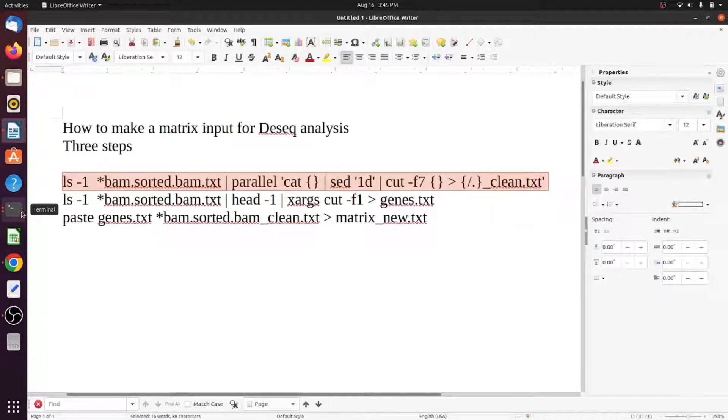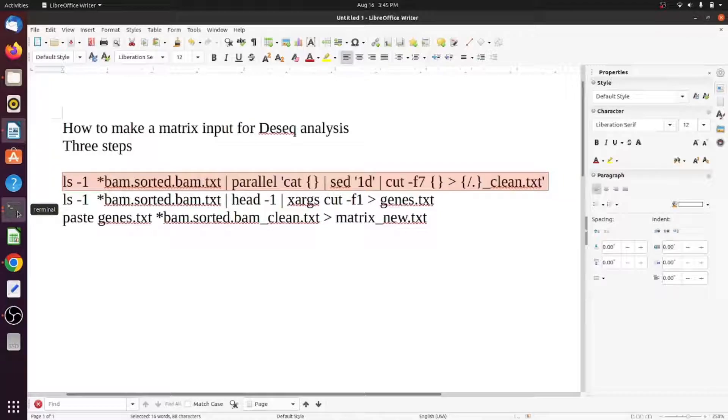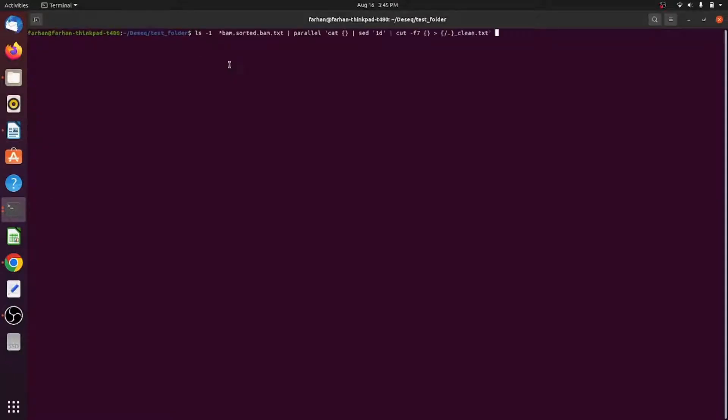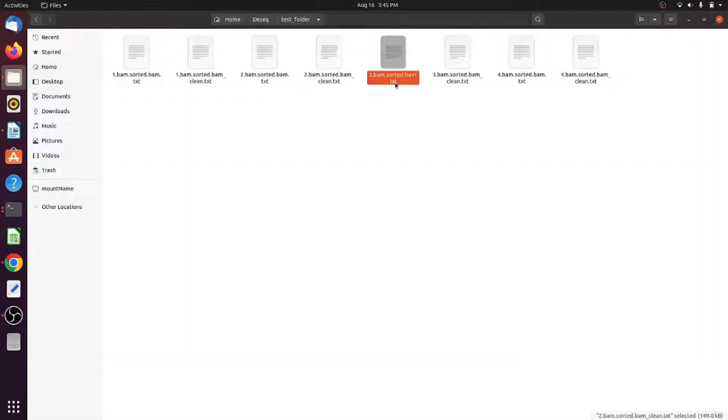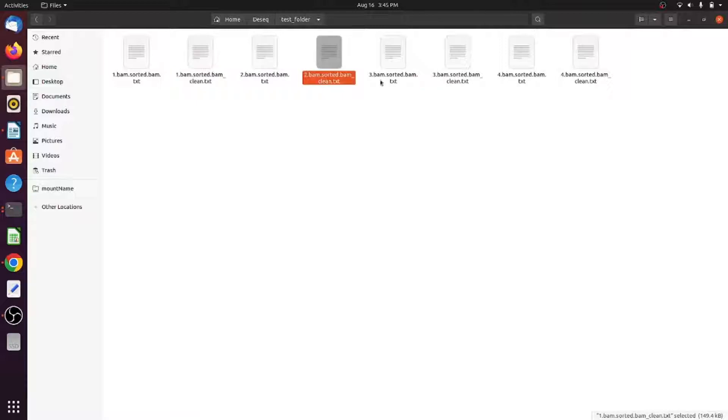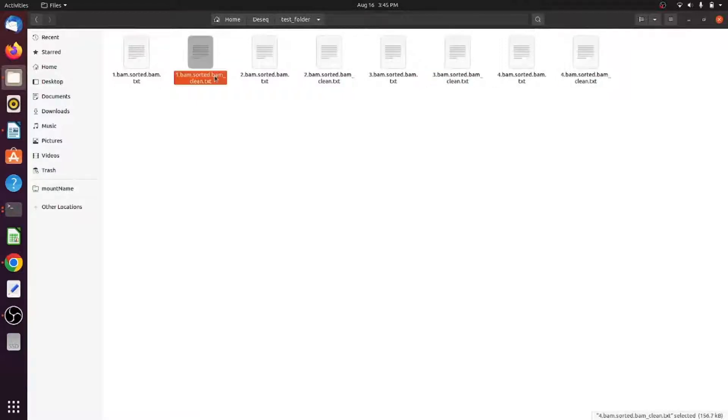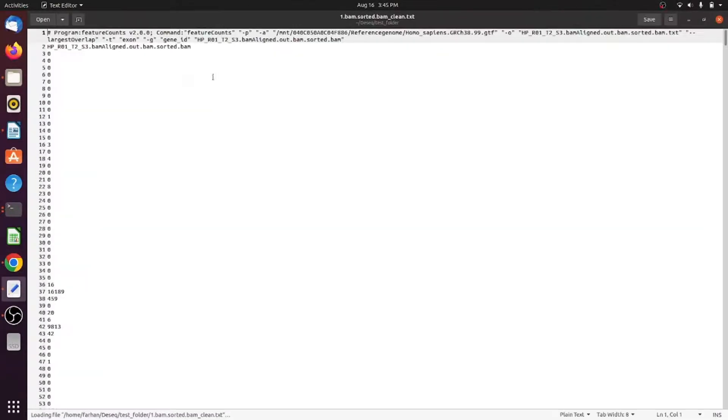These commands can be found in this video as well as on the internet. First you need to paste this command here and just enter. Now you can see there are four clean outputs, and this clean contains only the feature count values for each gene or ensemble gene ID.